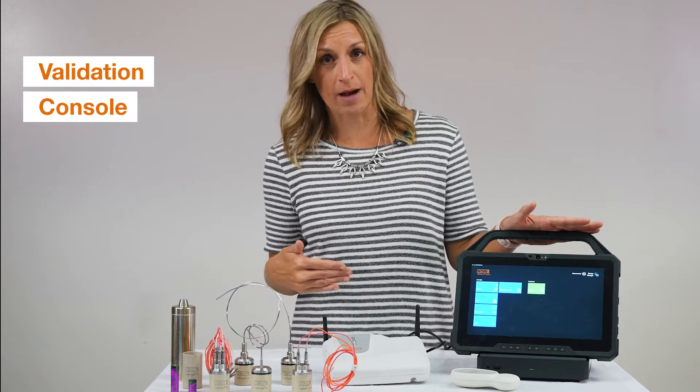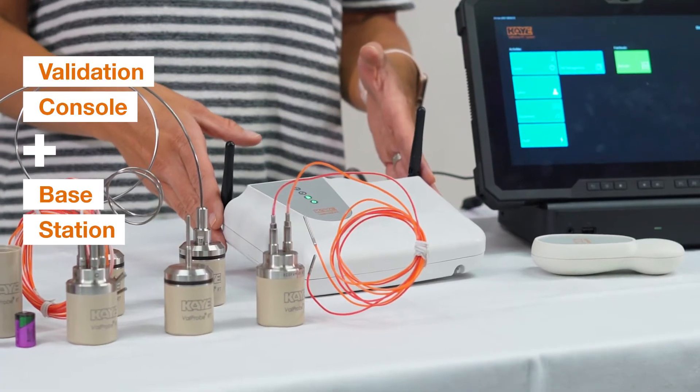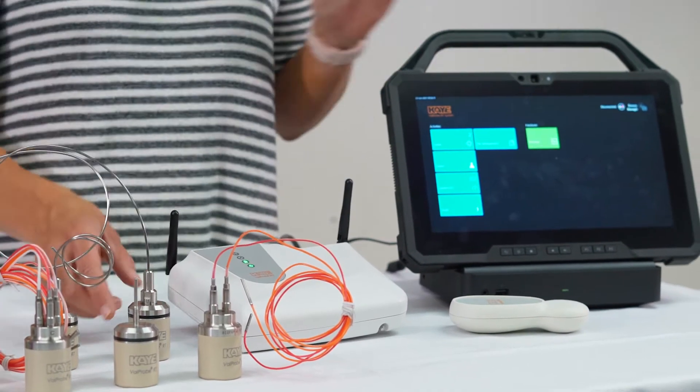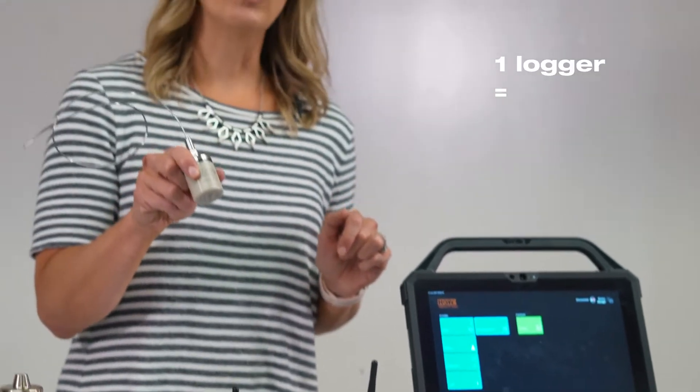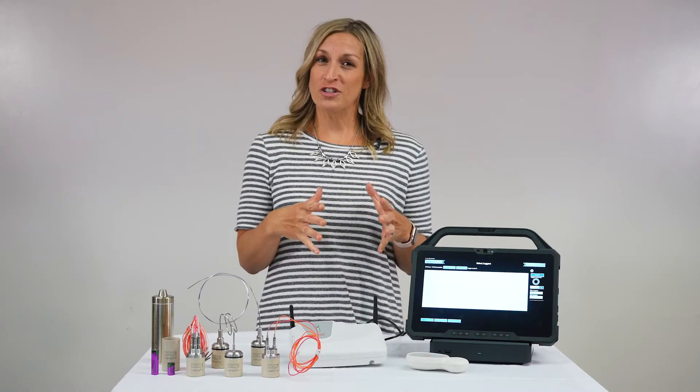As you can see here, the system consists of our validation console — the tablet that comes core-loaded with the real-time software — and a base station, which handles communication from the loggers to the software. Each individual logger holds 100,000 samples and has a nice peak material that gives a great RF signal.